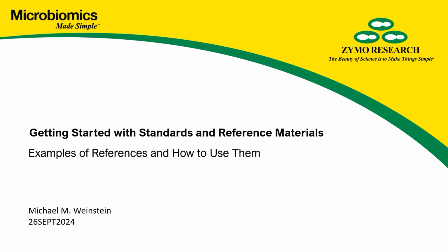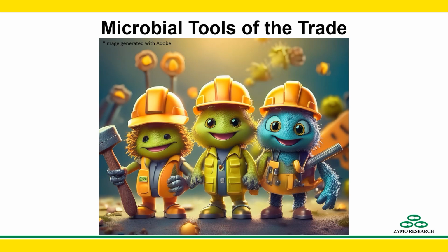Hi everyone, and welcome to the second installment of our series on getting started with standards and reference materials for use in microbiome analysis. This section is going to cover examples of references and how to use them, or as I like to call it, microbial tools of the trade.